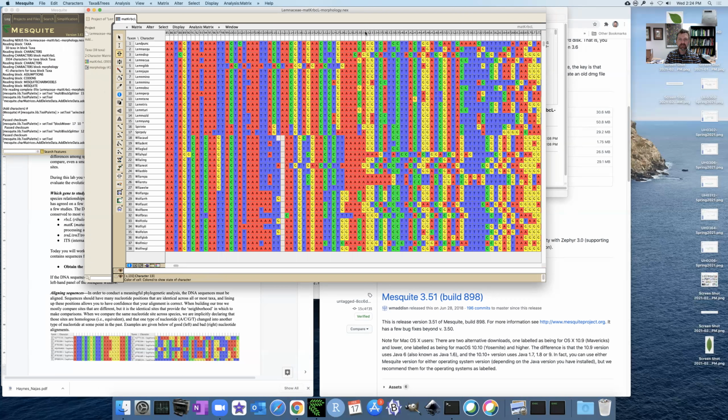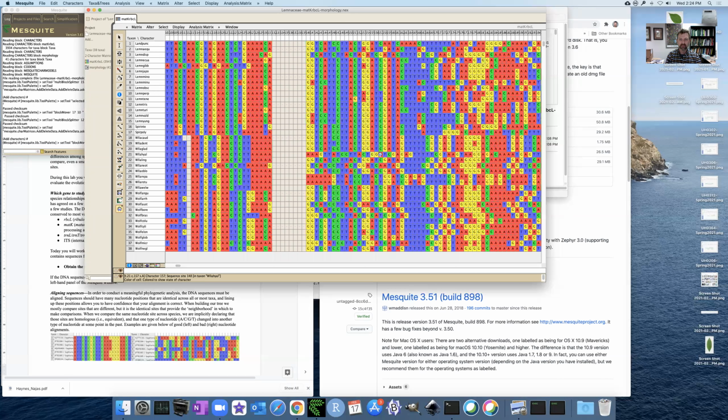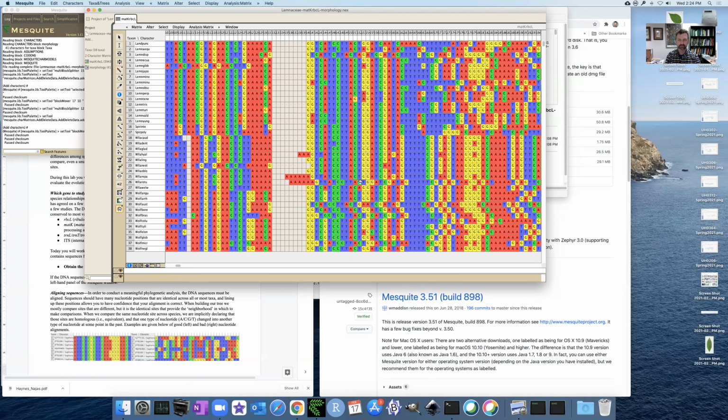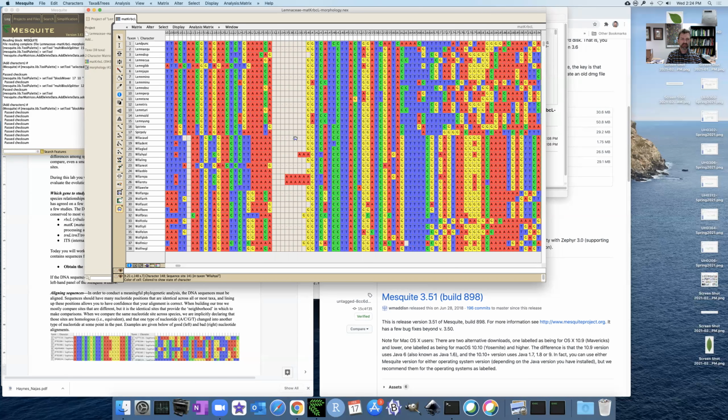Let's just maybe try to do a little bit of this. I'm going to create myself a little bit of a block there. And I've done this a lot. It's almost a hobby at this point. But I just want to maybe show you how these things can fall into place if you get them to align just right. So at least in this block of letters, now we've got a block that's looking pretty similar. This area where I push things around a little bit, looks like a couple of these have just a lot of extra A's there.